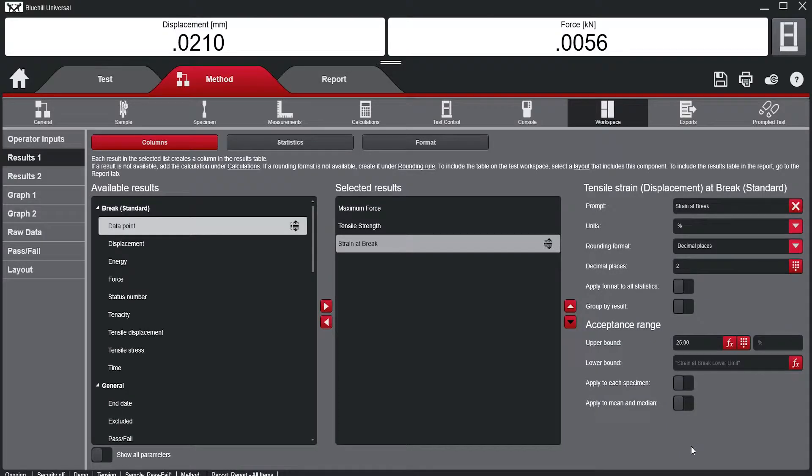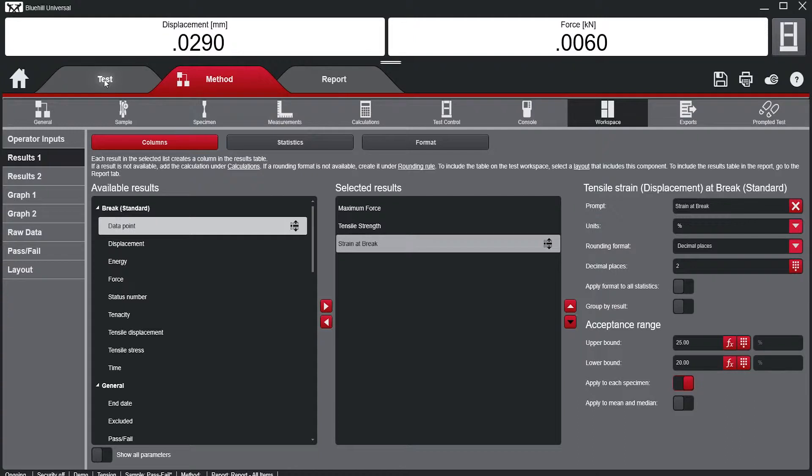The user can toggle whether they want the criteria to be measured against each individual specimen or the sample as a whole.